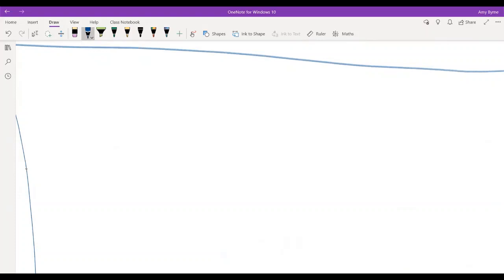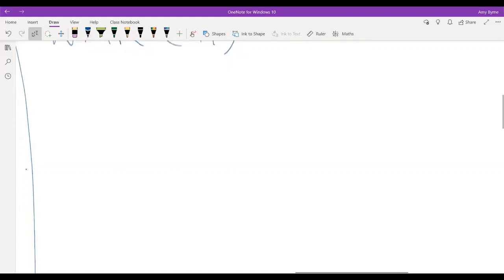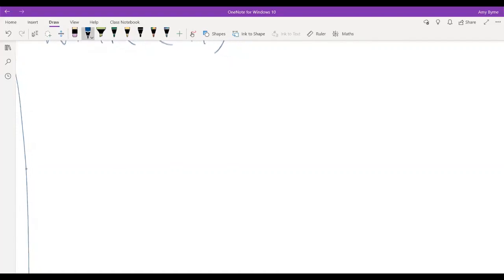In a sample, so just note that this is proton NMR. I have a sample that has a whole bunch of hydrogen atoms in it. So a hydrogen atom, unless it's deuterium, has an odd number of things in the nucleus.